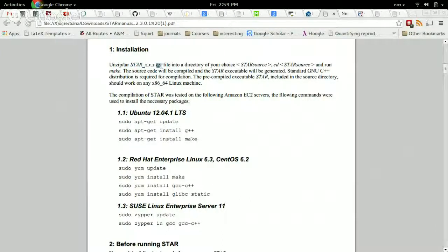This is a tar.gz. So a tar is a way to turn a directory into a file. And then once it's a file, you can then gzip it. So with zip, you can either zip a single file or a folder, and you end up with a zip file. But here, gzip only works on files, and so to do a directory, you have to use tar. Does that make sense? Yeah.